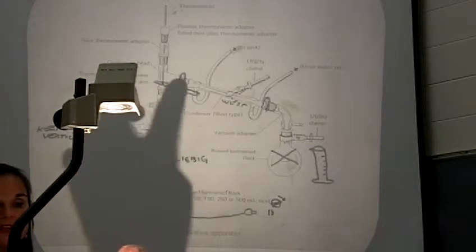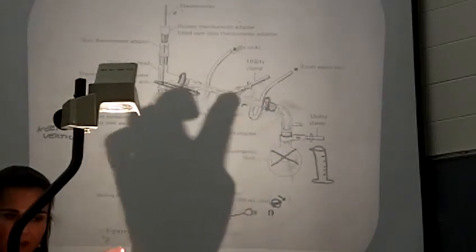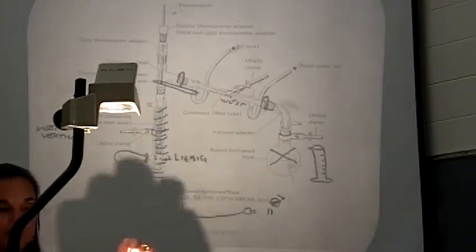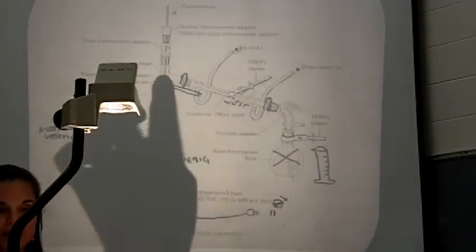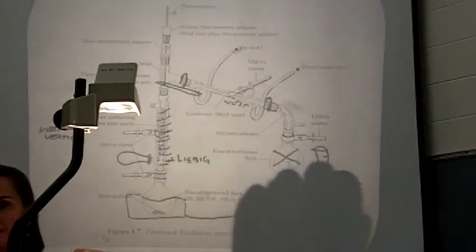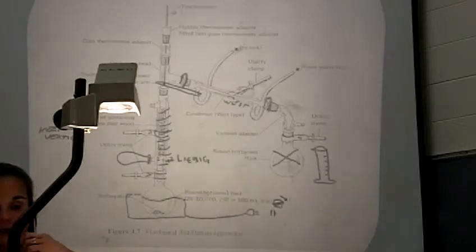Okay. The other thing is just make sure all of your joints are completely tight. Use a little bit of vacuum grease. Make sure everything is sealed throughout, because you don't want to be distilling here and lose it out of a joint here or lose it out of a joint here and not be collecting temperature versus volume, because what you're going to plot in the end is the temperature versus the volume that you collect. So you need it over here. You also need it for the chemical tests, okay?